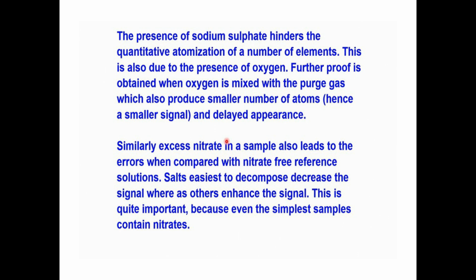So, if I discuss the presence of sodium sulfate, it hinders the quantitative atomization of a number of elements. This is due to the presence of oxygen. Further proof is obtained when oxygen is mixed with the purge gas, which also produces a smaller number of atoms, and a smaller signal is observed, which appears at a much later time, or you can say the delayed appearance is there.